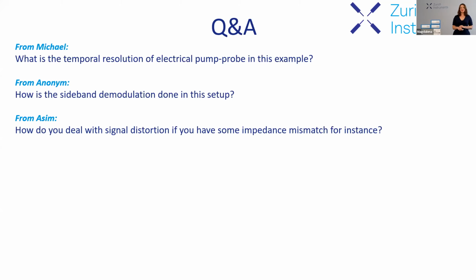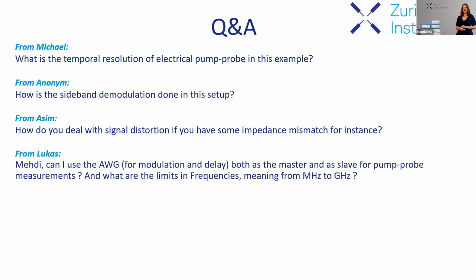Great, thank you very much. We still have some time for more questions. Lucas wants to know if he can use the AWG for modulation and delay, both as the master and as a slave for pump probe measurements. And additionally, what are the limits in frequencies, from megahertz to gigahertz?